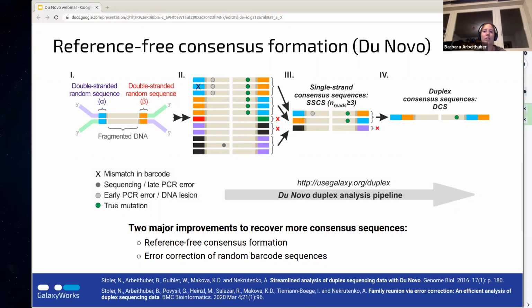when performing the duplex sequencing, you have to consider that for being able to reliably call variants, you need to have at least 3 initial PCR products for each strand sequenced to get informative information on variants.